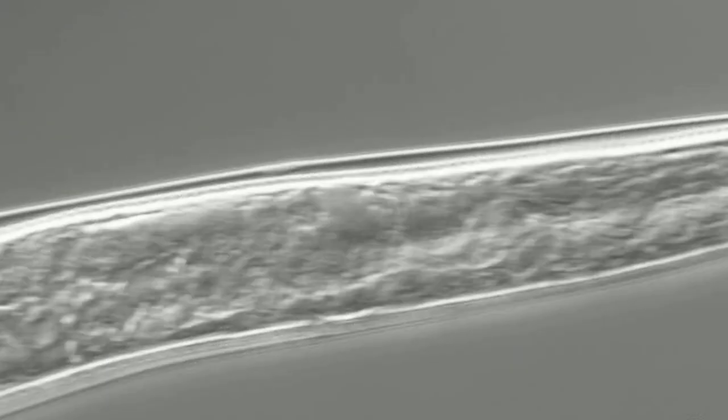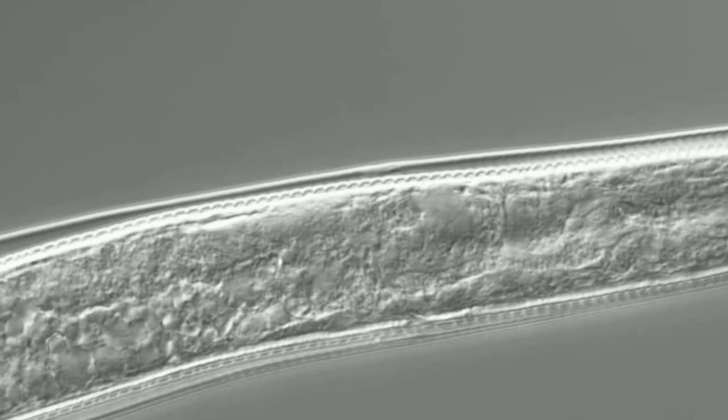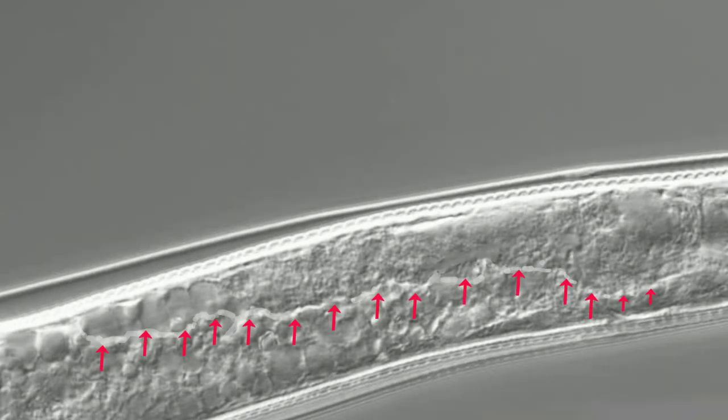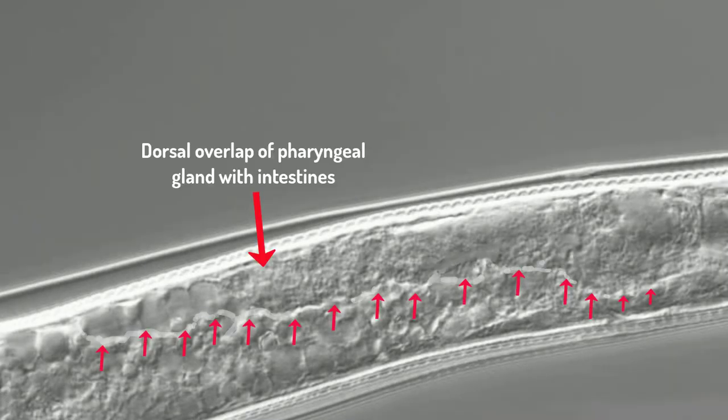Furthermore, when we move posteriorly towards the intestines, we clearly see that the pharyngeal glands overlap the intestines on the dorsal side of the nematode.